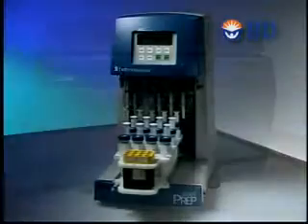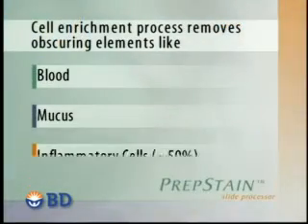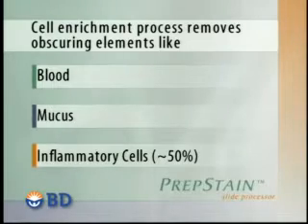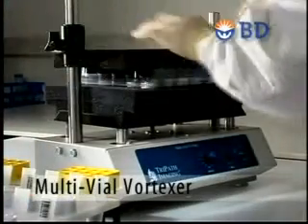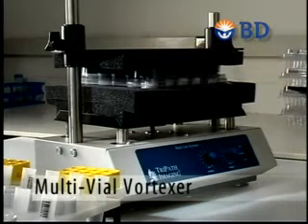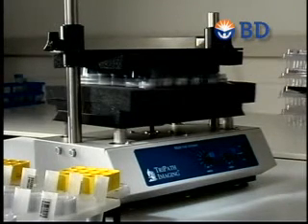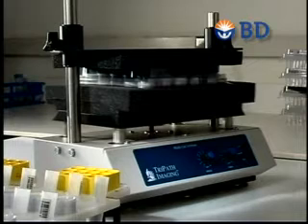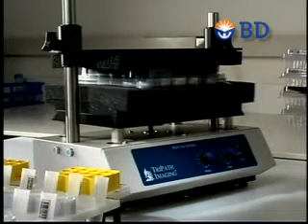Our proprietary cell enrichment process removes obscuring elements like blood, mucus, and inflammatory cells. This process is what provides the SurePath difference in sample clarity and homogeneity as compared to the conventional PAP method. Once accessioning is complete, a tray of SurePath vials is placed onto a multi-vial vortexer for 15 to 20 seconds. Vortexing randomizes the cell sample, partially disaggregating any cell clusters, and helps free any cells clinging to the submersed collection device.